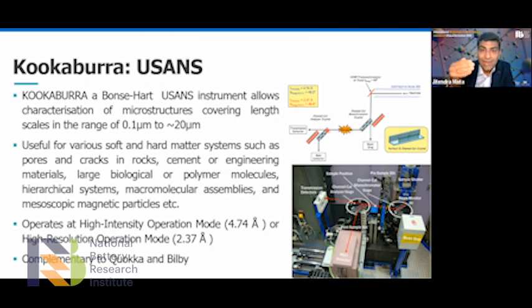So you're collecting scattering at each angle of this rotation. What happens if you don't have a sample here, and this is like a periscope? Basically, if you do the rocking curve, the intensity will go up and then it will fall down. But if you have a sample which is scattering, then if you do the rocking curve, your intensity will still go up. It will fall down, but the falling down rate is different, and it may not fall down as steeply as for the empty position.